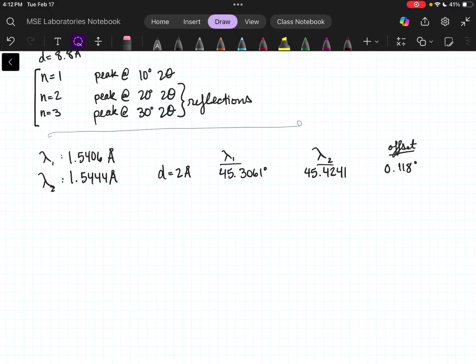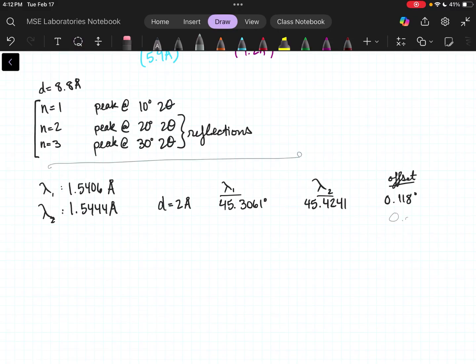So remembering that 2 angstroms, that's going to be up here on the right-hand side of our graph. And that's pretty significant. Our step size for XRD is usually going to be 0.02 degrees. So that's our step size. So we're collecting 6 steps in between the first and the second peak of the same origin. So that's significant enough that you can visibly see it. It's going to look something like this with 2 very distinct peaks.